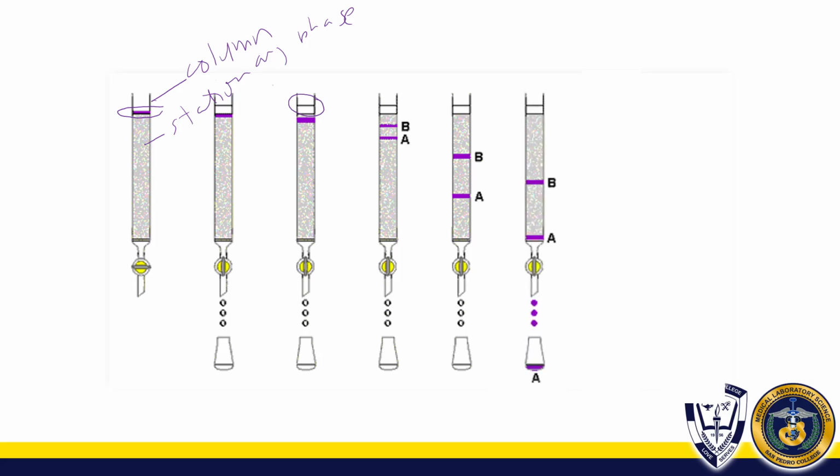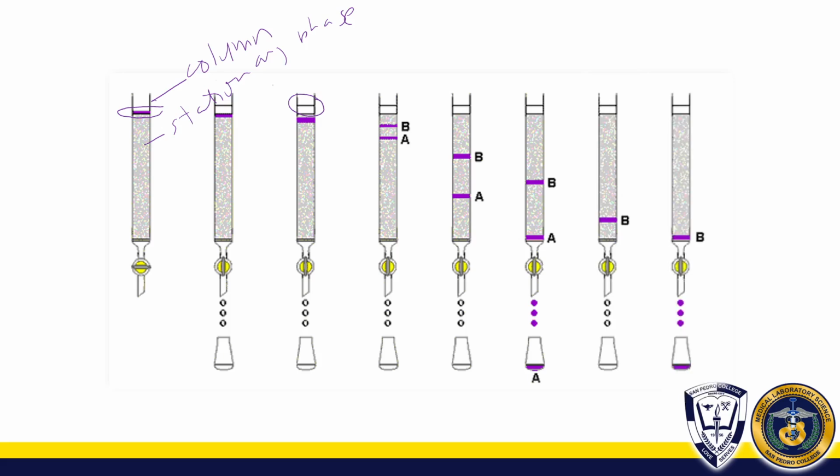And then, syempre, naay mauna and naay maulahi in terms of the separation, but in terms of who comes out first and who comes out last, that would depend actually on what are the substances that you fill in or you used, unsa ang nasa inyong stationary phase, unsa inyong mobile phase, and unsa inyong eluent. And we will discuss that further later. So basta again, what I am trying to point out here is that for you to have a general view lang kung unsa ning separation and chromatography is all about.